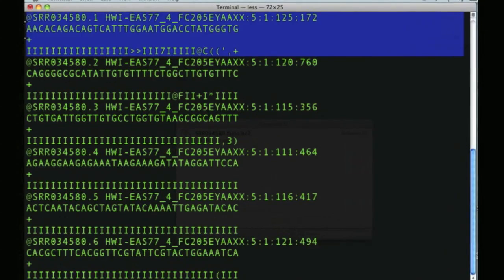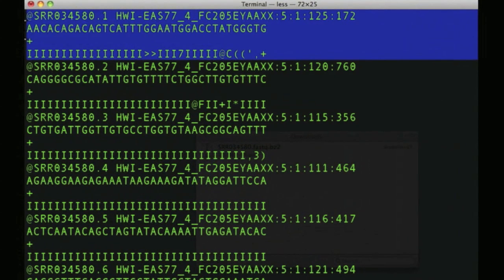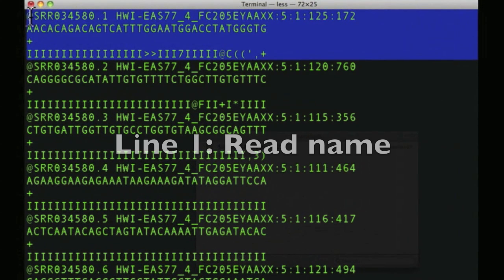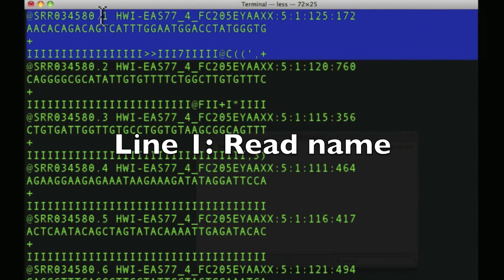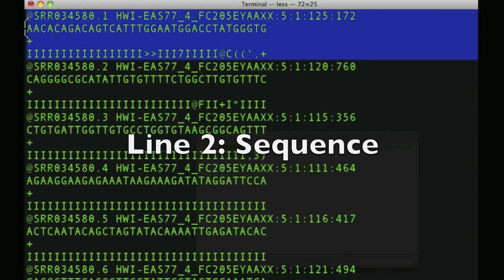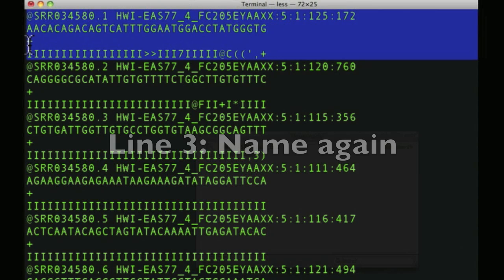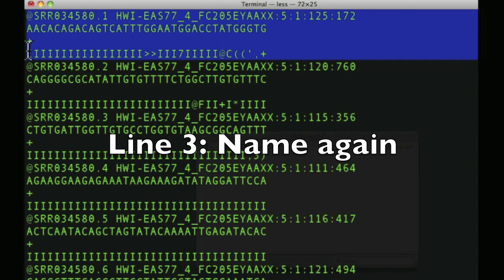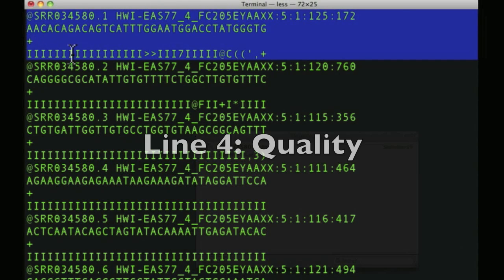Let's zoom in a little bit here. First is the sequence identifier, the sequence name, the read name. Next is a bunch of information from Illumina about flow cell, etc. Then is the sequence itself. And then there's another line, which is another place for the name in some formats. And at the bottom here is the quality score.